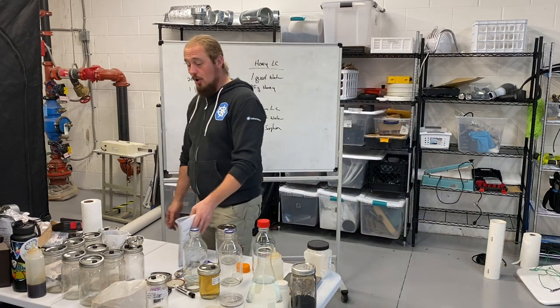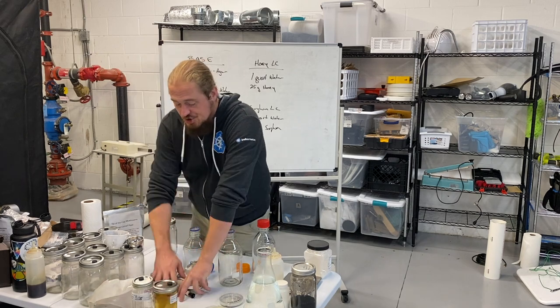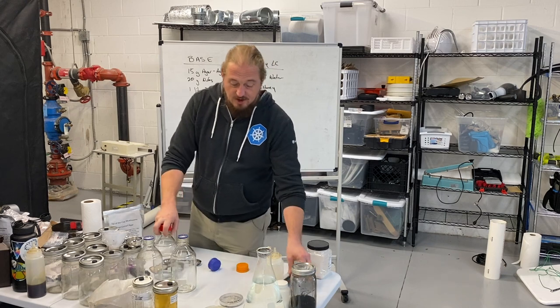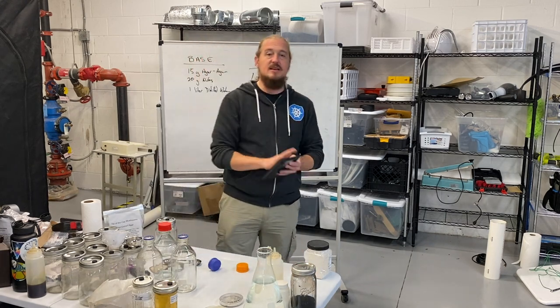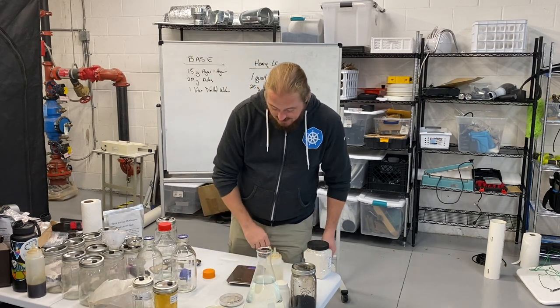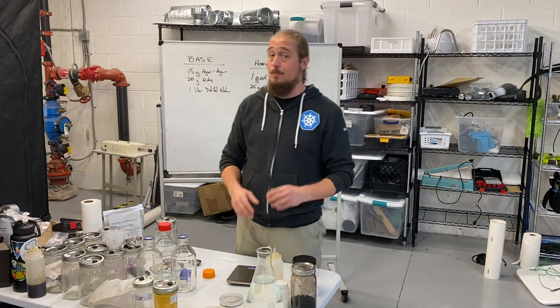With a liquid culture, all you're going to do is mix this just like your agar scale. So first thing you're going to get out is a nice sensitive scale that can handle grams. You want something that's pretty precise.